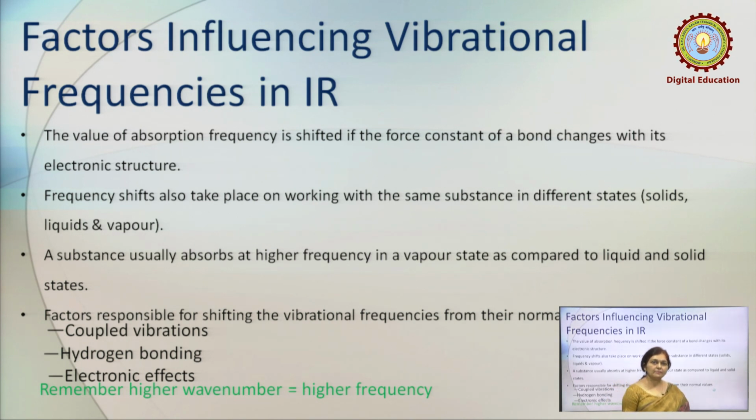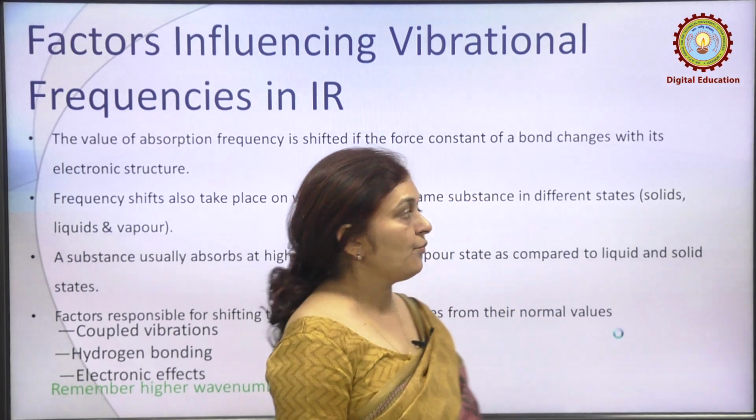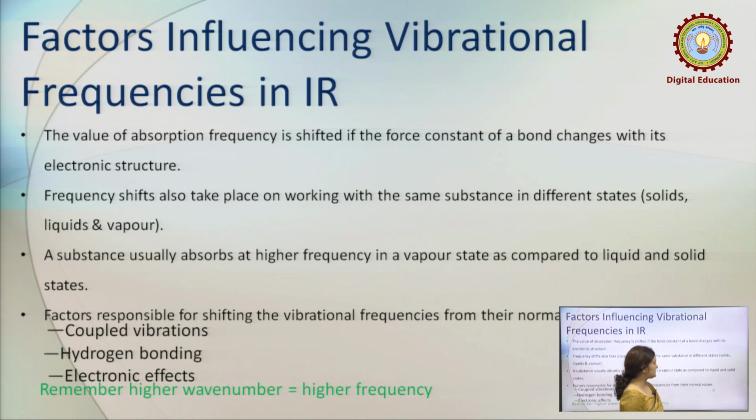The value of absorption frequency is shifted if the force constant of a bond changes with its electronic structure. Frequency shifts also take place on working with the same substance in different states like solid, liquid and vapor.